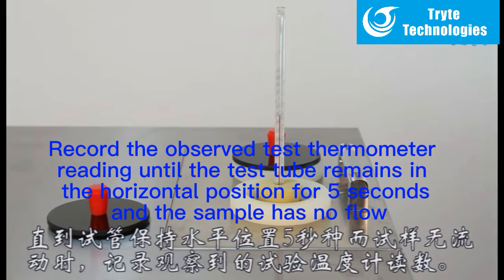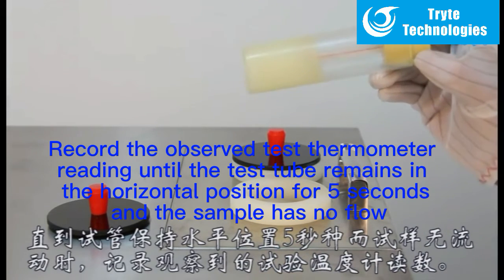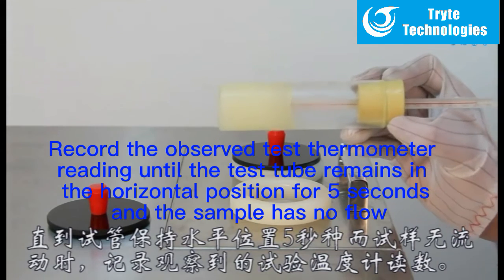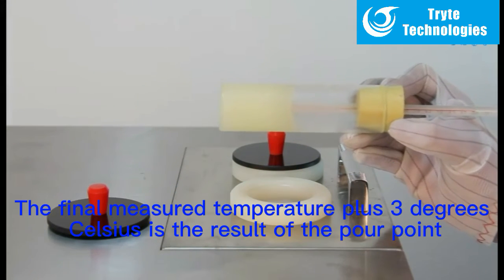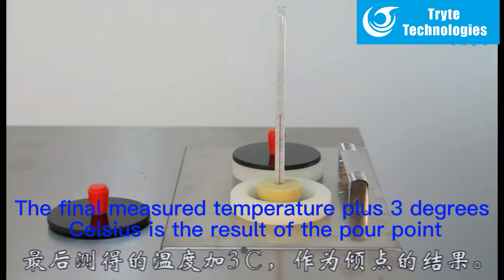Record the observed test thermometer reading until the test tube remains in the horizontal position for 5 seconds and the sample has no flow. The final measured temperature plus 3 degrees Celsius is the result of the pour point.